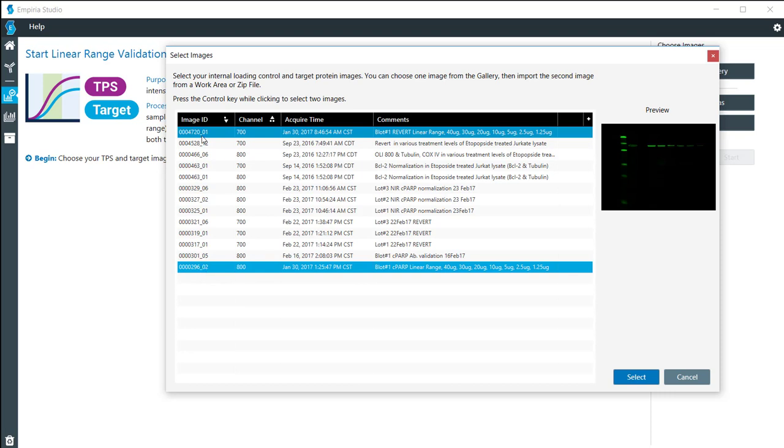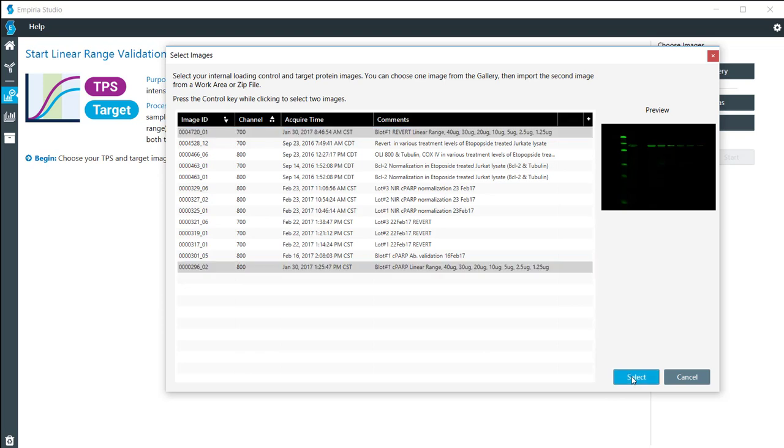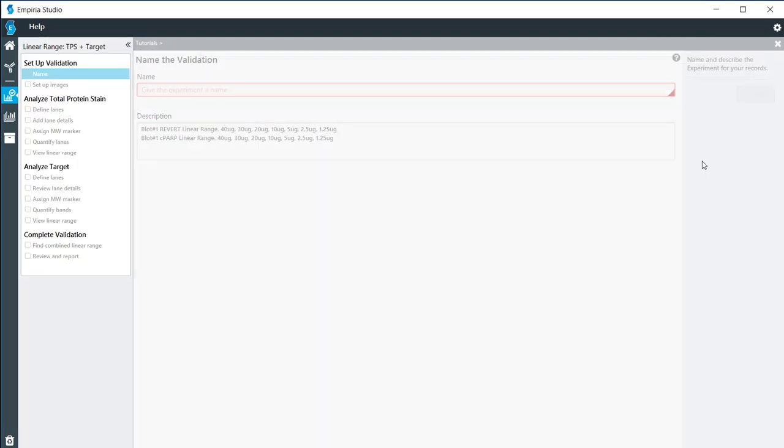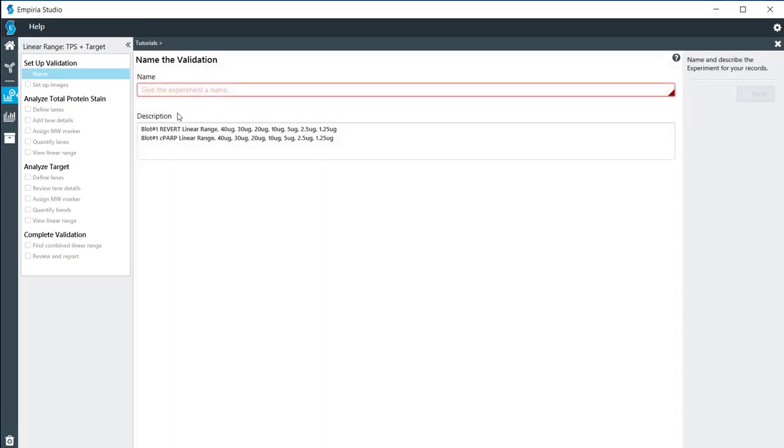These are coming from two different scans because the membrane was scanned first with a revert stain and then it was processed with the antibody. We have both of the images right here and I'm going to click on start.